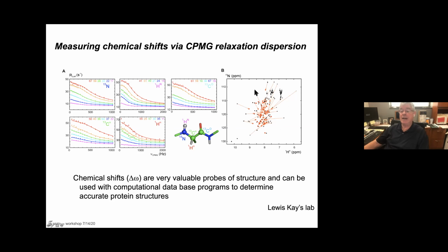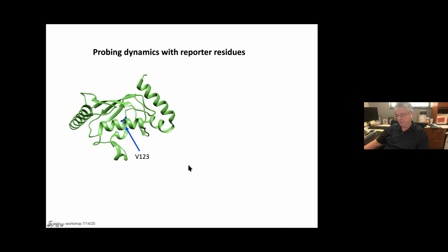This is just an HSQC that shows you that these shifts might be large, but they might be averaged, okay? And getting out all of these states requires fitting this data, okay? And this has been applied in Lewis's lab and Peter Wright's lab extensively, and there's beautiful work in the literature I refer you to. So if everything was sweet and honey, we wouldn't be going on any further. We'd just say, go read Lewis and Peter's papers. But there are some issues.